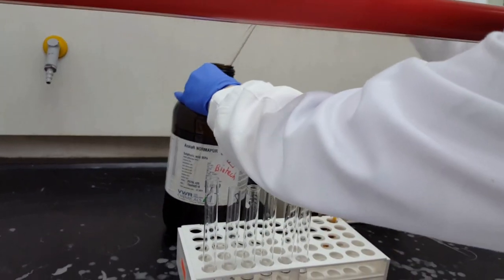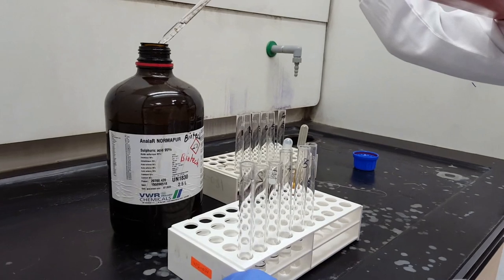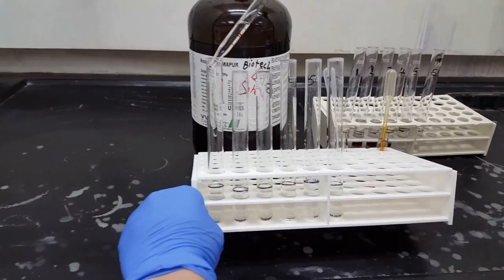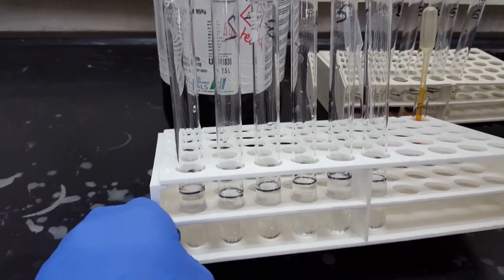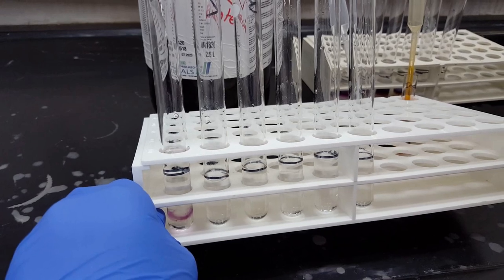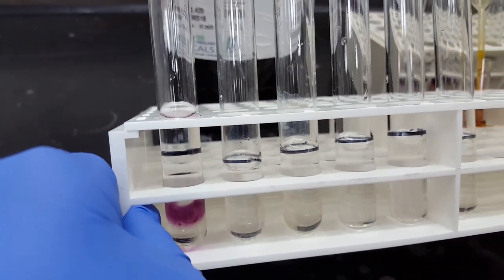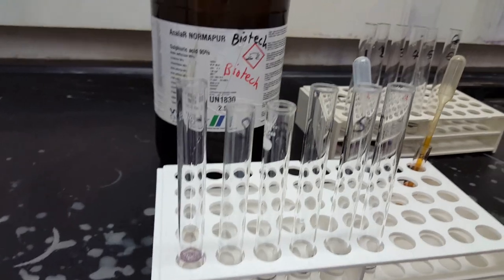What does the sulfuric acid do here? It's going to dehydrate the carbohydrates, and it will form the product furfural. We'll discuss it later. Add 2 ml. Observe the purple ring. This is the product. Then we add another 2 ml. Can you see the purple ring clearly over here? It's like an interface between the aqueous solution and the sulfuric acid. So this is the result.